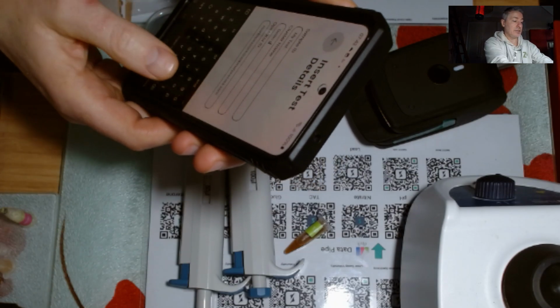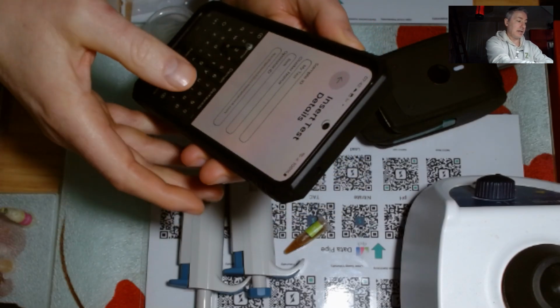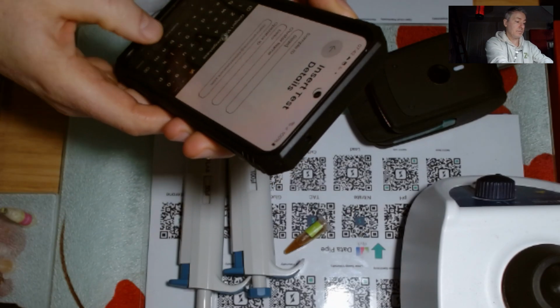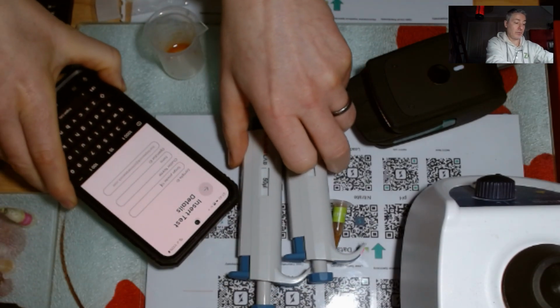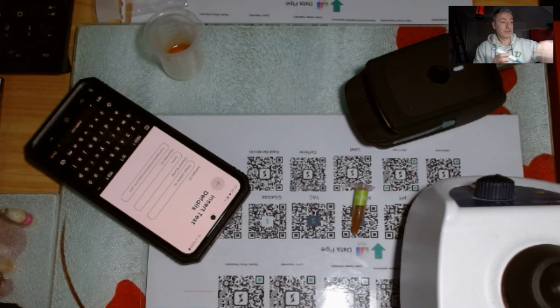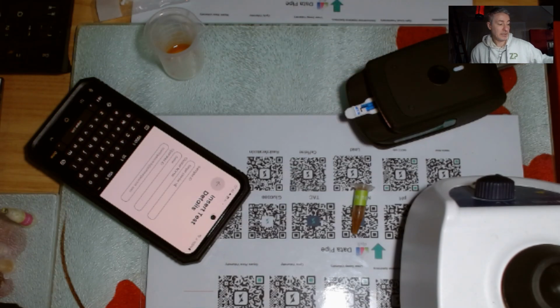I can look at ginger demo. I can do ginger powder. I'm testing a 1 in 10 dilution. So I've got my 1 in 10 dilution set up there. I'm just going to take my pipette and put 50 microliters onto the sensor. So let me just take a ginger sensor. I should say, it's really a ginger oil sensor, but I close that up.